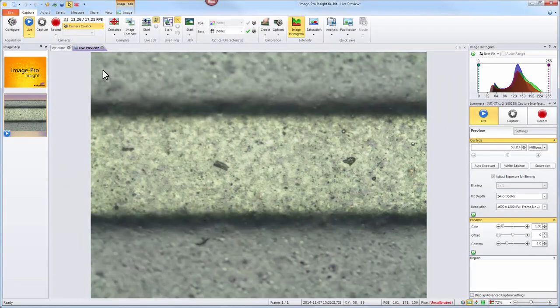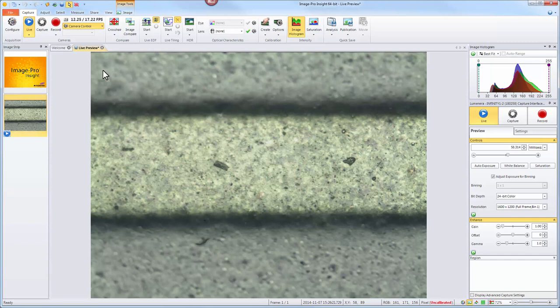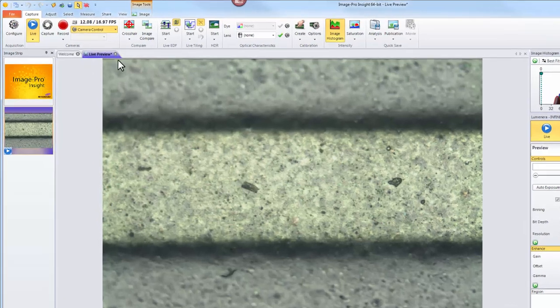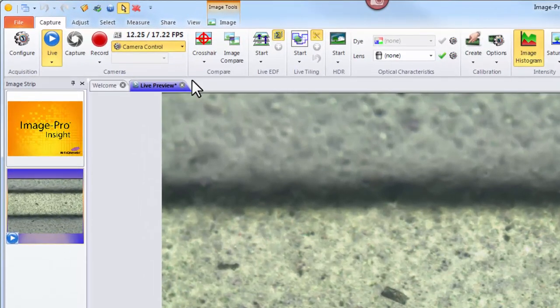This tutorial will teach you how to configure your optical lenses and spatial calibrations in ImagePro Insight 9. In our last video we installed all the necessary components to achieve a live preview in ImagePro Insight.